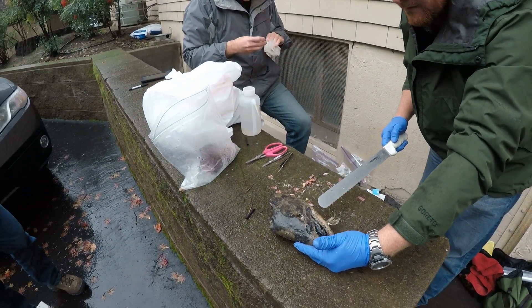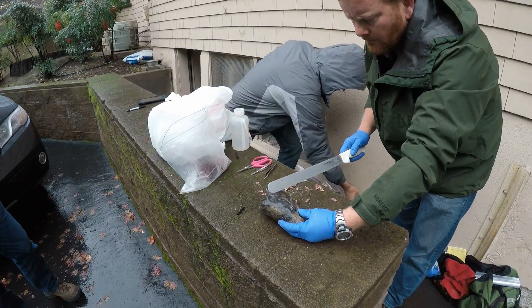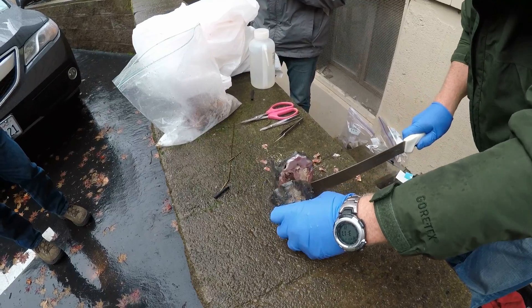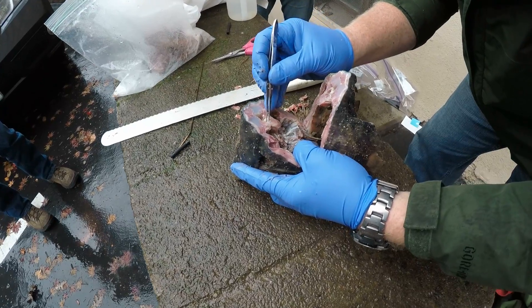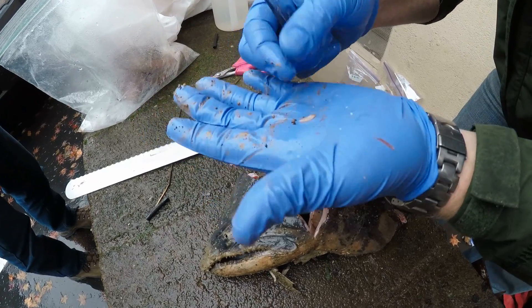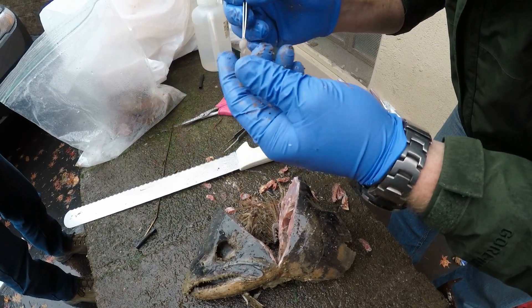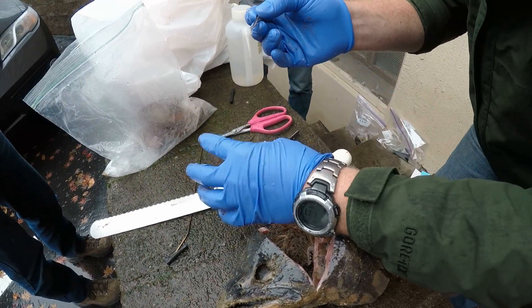These carcasses give us a lot of information about the health of the fishery and what's going on in the watershed. What we're looking for here is the otolith structure, which is located just behind and kind of below the brain. What we do is we cut into the skull — and we pull out these little structures. They're in a little sack of fluid.